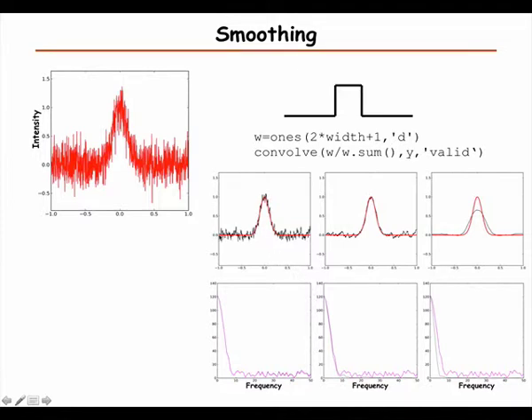If we vary the width, here we chose a width that's not wide enough. So we still have quite a lot of noise. Sorry about the choice of colors here. There is almost no difference between the gray line and the other, just a little bit of difference out here. That's why we still have a lot of noise left.